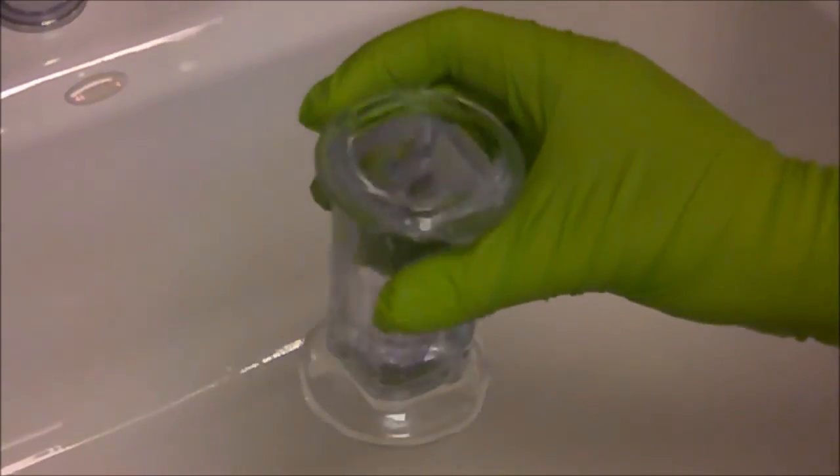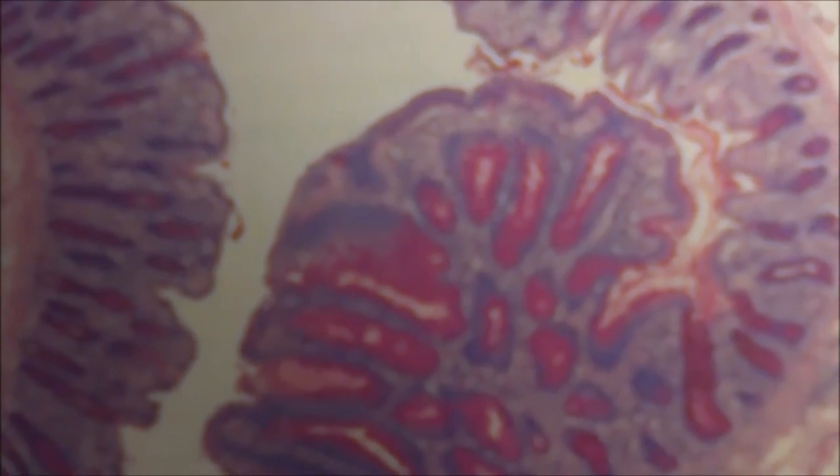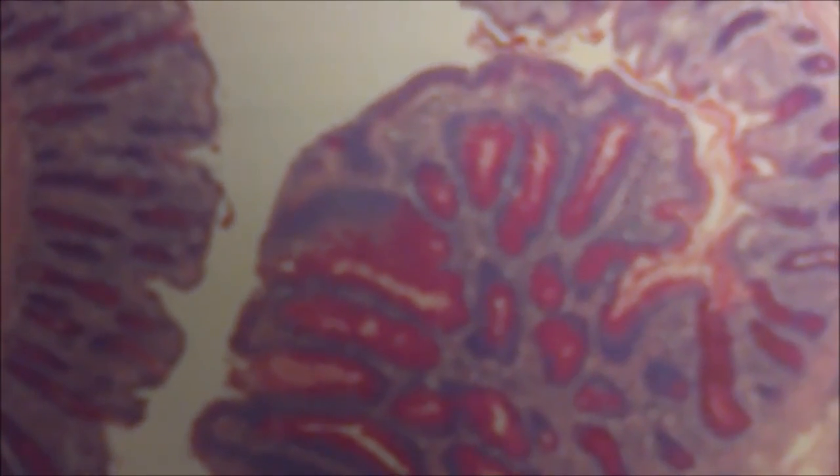We're going to dehydrate in 95% alcohol, 100% alcohol, and then xylene, and then coverslip. After you coverslip, your slide under a microscope should look like this. The PAS stain is going to be the bright red — the carbohydrates are going to stain bright red.